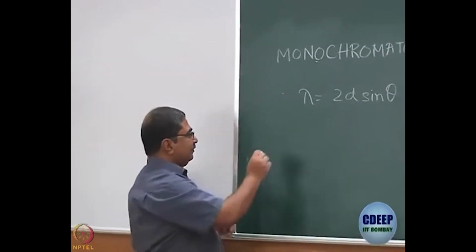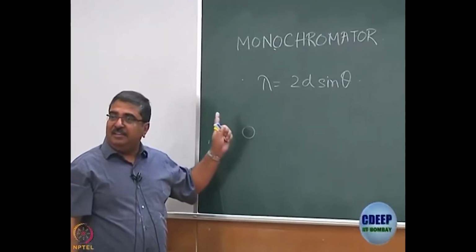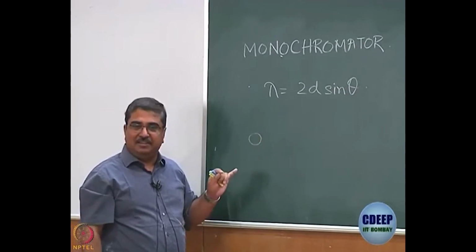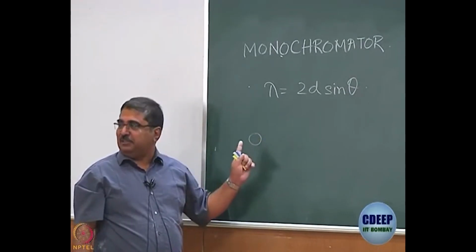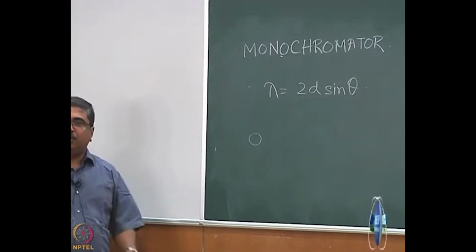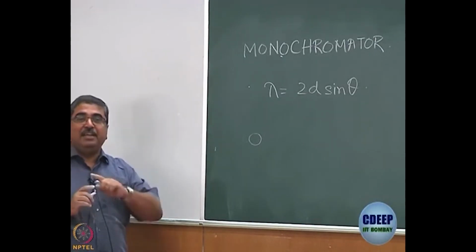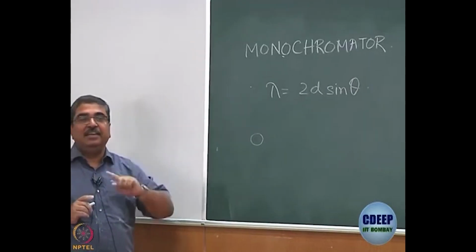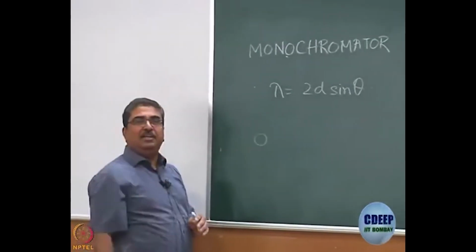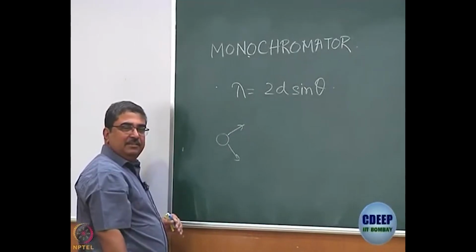But now the problem is this, I have some light source, okay, can be the lamp or can be the sample itself if you are talking about emission, okay. It is always considered to be a point source, okay. Now, if it is a point source, in which direction will light be emitted? All directions, right. Unless it is a laser, we will talk about lasers later on, but there is a reason why lasers have such a highly directional output, it is not straightforward, okay. If you just take a simple lamp, something like a tube light, then light goes out in all possible directions, okay.